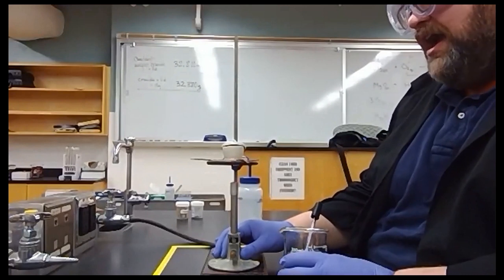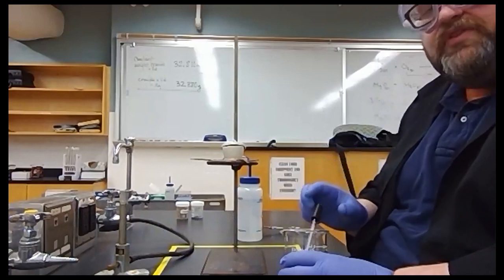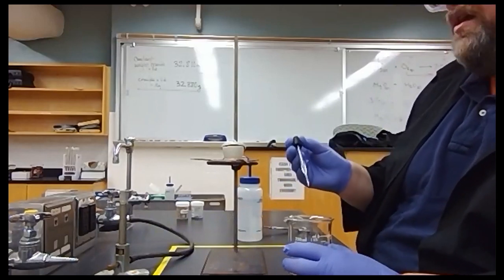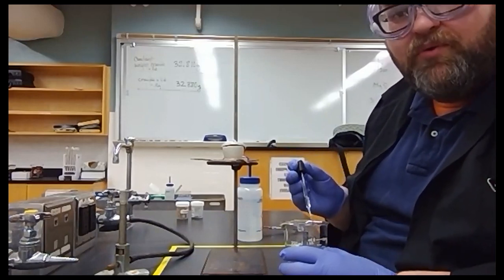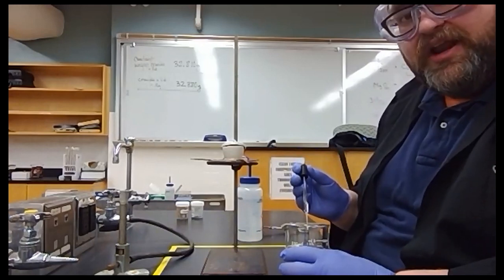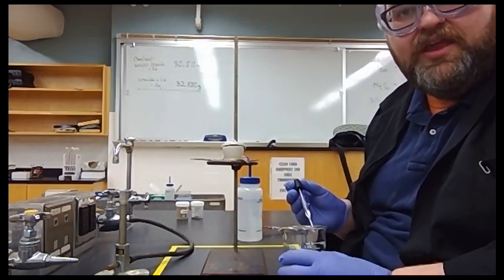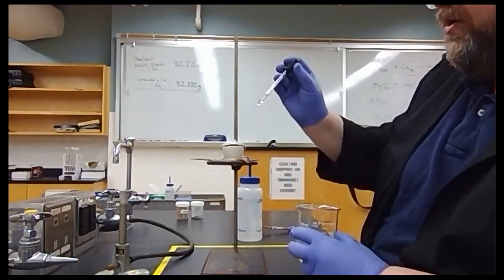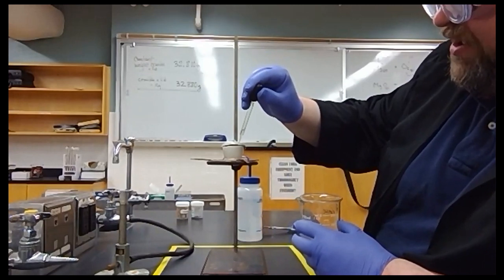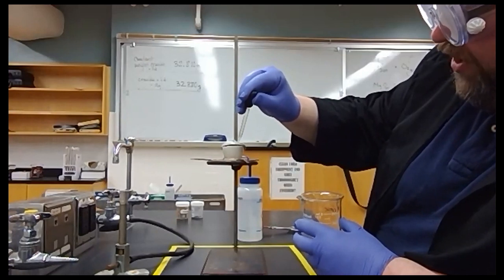So first, I don't want squishity slashity, so I'm going to move the gas out from under that, and I'm going to give this a second to cool down a little bit. Then I'm going to take one dropper full of water. This is way more water than is actually needed to do this conversion, but I want to make sure that I get it all. It's better to have an excess of one reagent that I can have in excess easily than to not have enough. So I'm going to put my water in here, and we're going to notice steam coming out immediately.